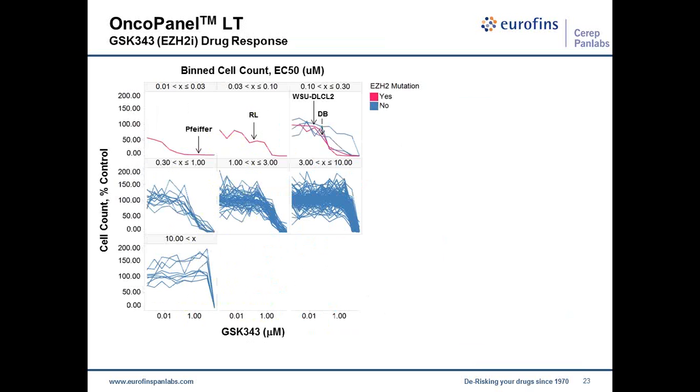This was all well and good, but to really validate this profiling service, we have to convince ourselves that the form in which the profiling is offered is sufficient to identify the right genomic biomarkers. So again, we returned to our case study, which was the EZH2 inhibitor GSK343.